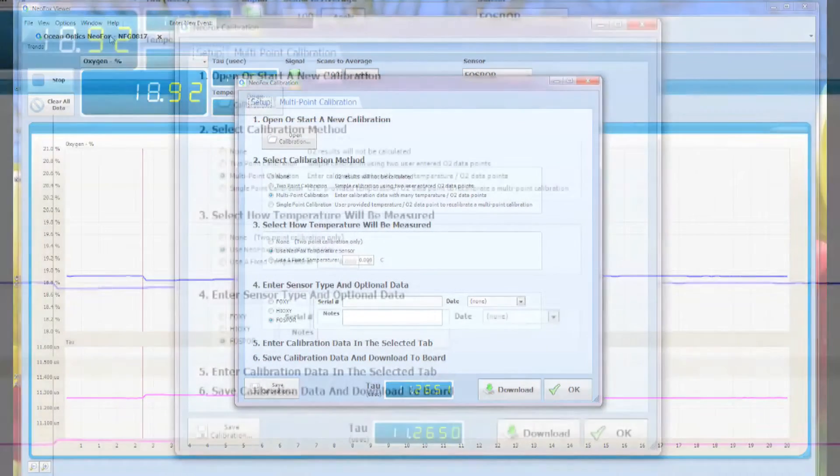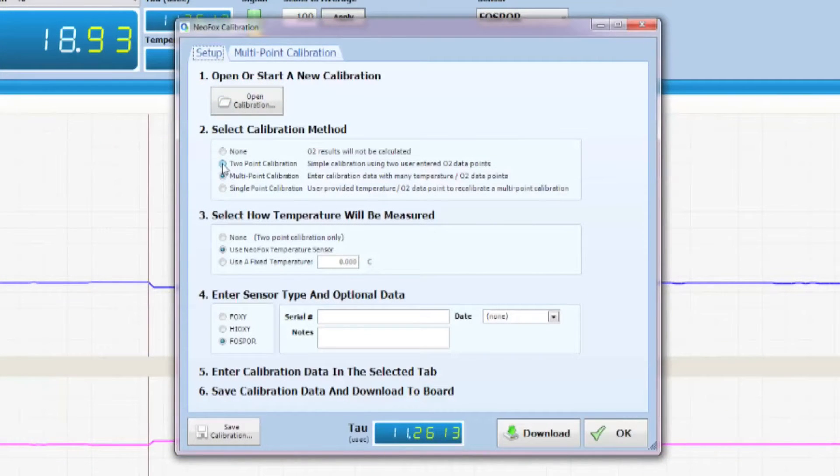In the setup box, you're going to click on two-point calibrations up at the top and down at the bottom, make sure you have the correct chemistry for your probe choice selected: phosphor, hi-oxy, or foxy.